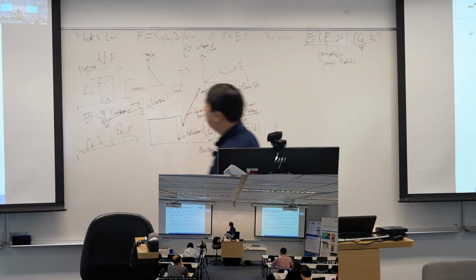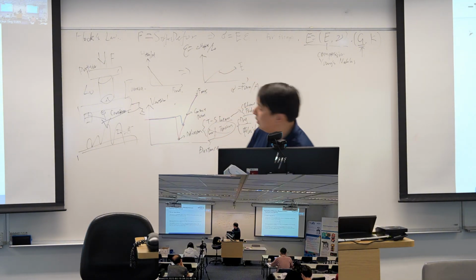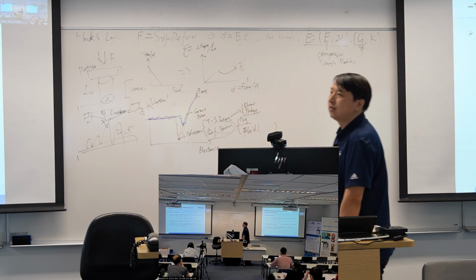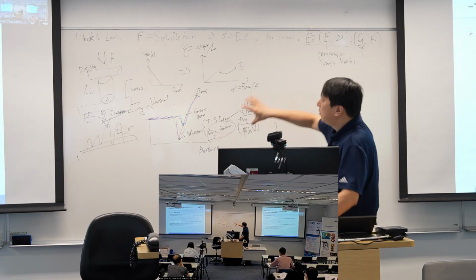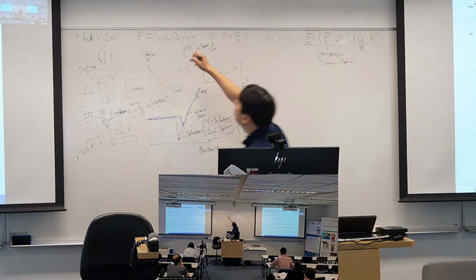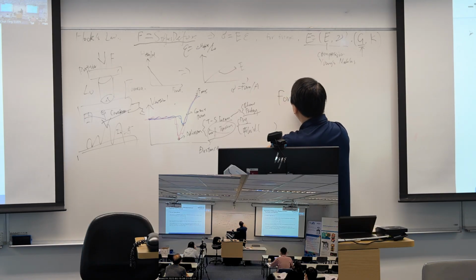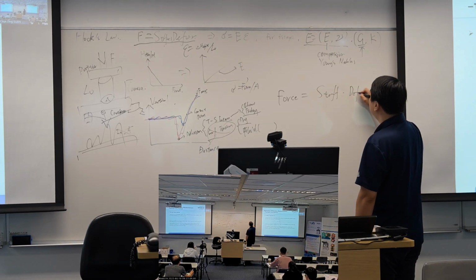And then finally we capture a force curve. Of course, there is some noise. That's the final force curve we get. And then for this sample, we need to echo back. We want to get the stiffness. So our equation we write down here is the force equals the stiffness times the deformation.